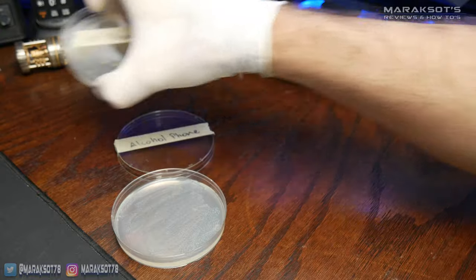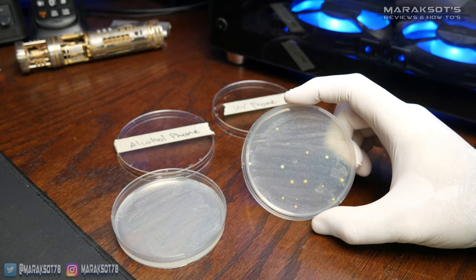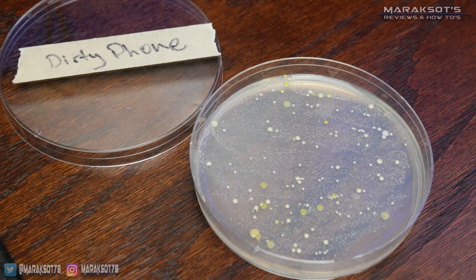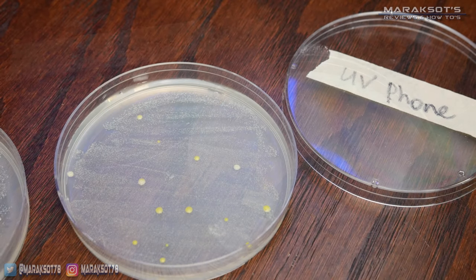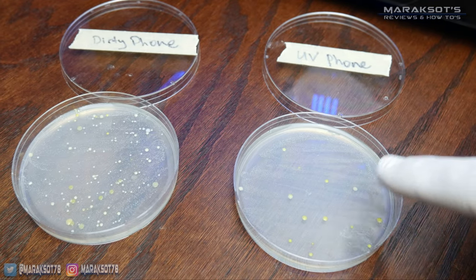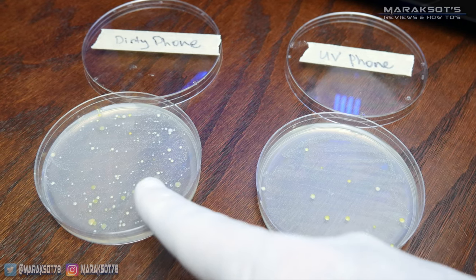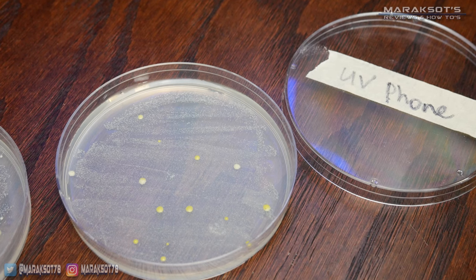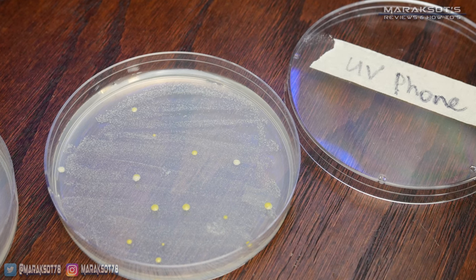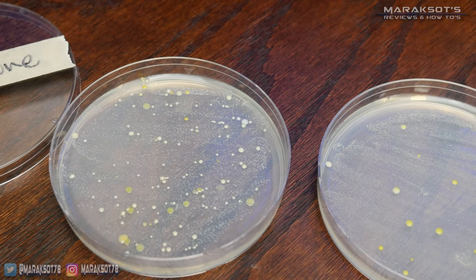This brings us to our fifth and final plate — just how did the UV phone sanitizer do? Compared to the isopropyl alcohol, not so well. But when you compare it with my phone screen before being UV sanitized, it's much cleaner. There are only 14 or 15 colonies I can see on the UV sanitized plate, whereas before cleaning resulted in more colonies than I care to even try and count. Also, we have to remember this is from a single 30 second sanitizing cycle on the screen side of my phone. Perhaps if I'd run it for a full minute on each side, there would be even less.